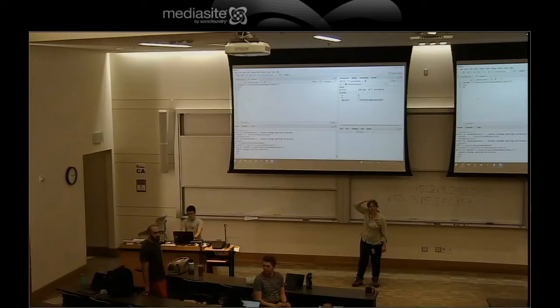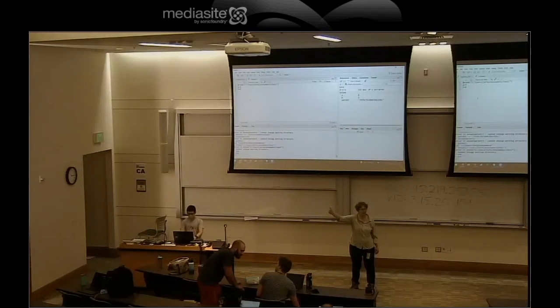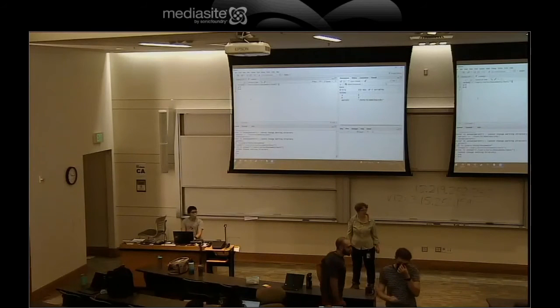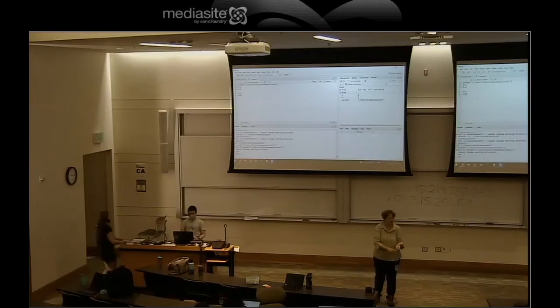Okay, what happens if I set my working directory to something, and then I set my working directory to something else? Okay, so I put in there set working directory, I did a bunch of stuff, and then I did set working directory to a different directory. What happens? That's right. When you run one line and then you run another line that changes the working directory, it will write over the last line.